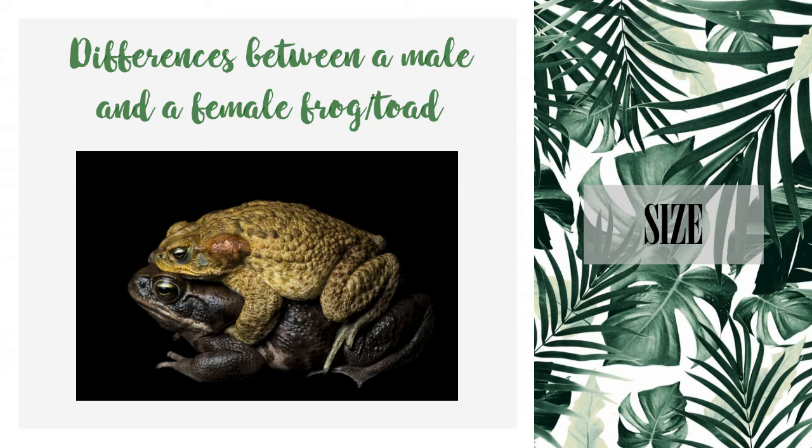The difference between males and females. Like any other organism, they have different gonads for the production of egg and sperm in both sexes. But for frogs and toads, their sex organs are found within their bodies, making it hard to determine the gender of the frog and toad. Good thing we have a great teacher, Miss Maria Cherian Gargonio, in helping us to determine which sex is which.